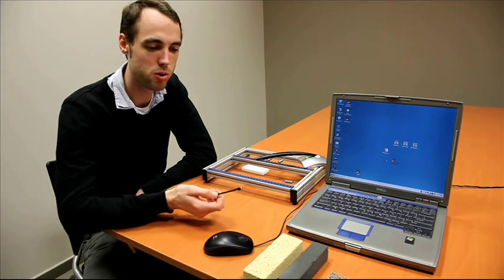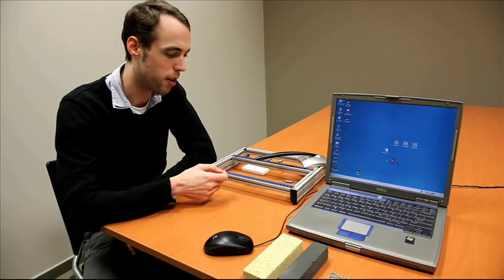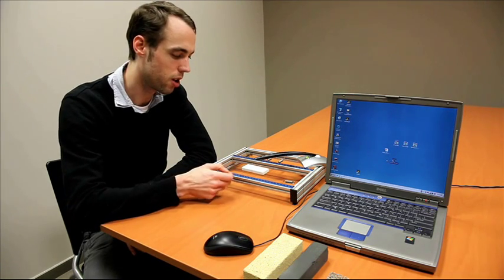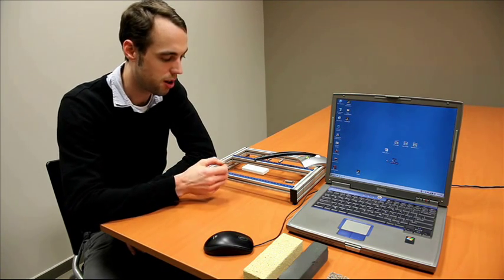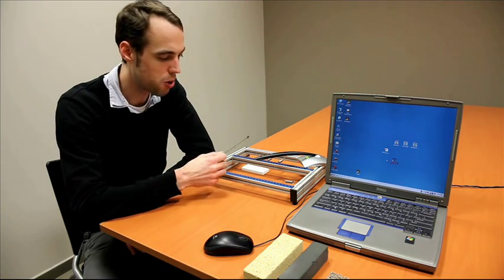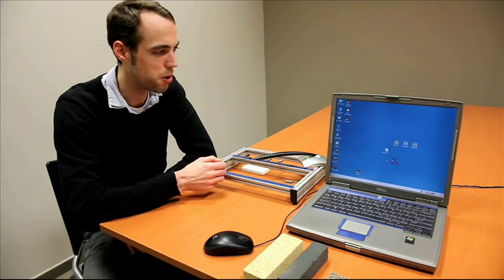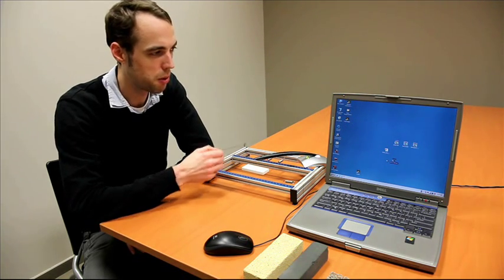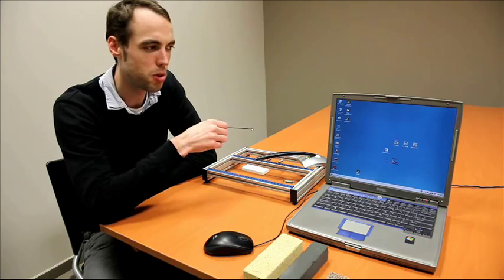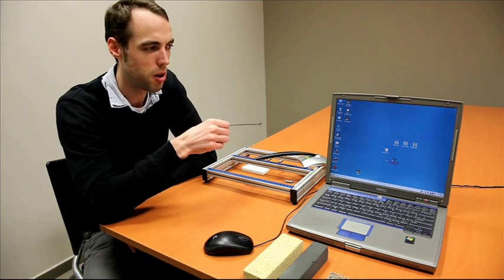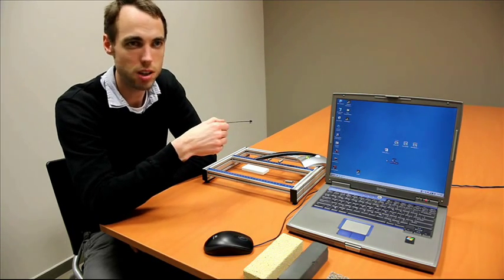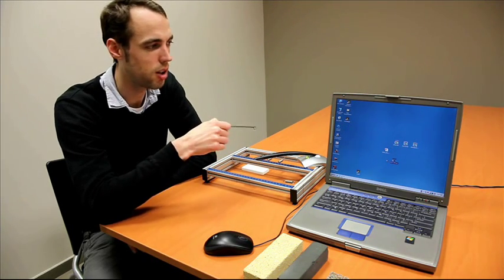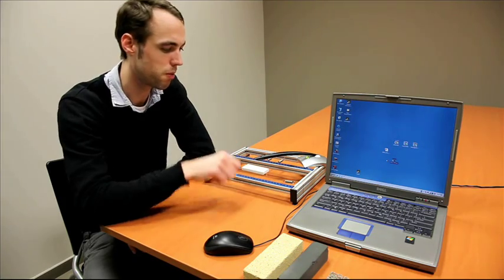What we're going to do is use this small hammer to tap the sample and record a vibration signal using this microphone. We will send the vibration signal to the computer where we will analyze the vibration signal and calculate the elastic properties.